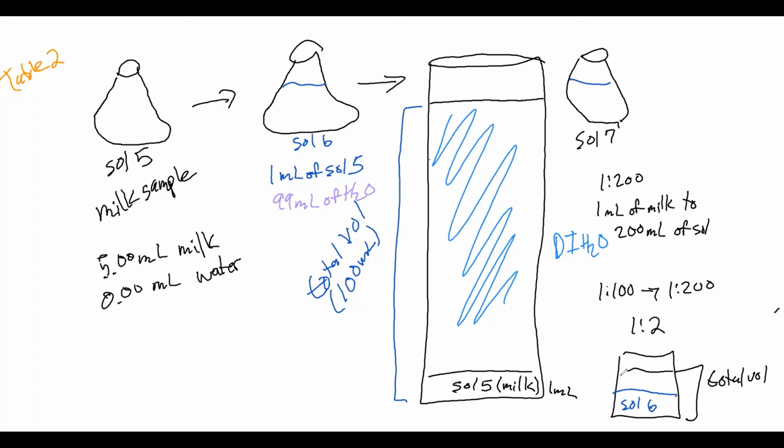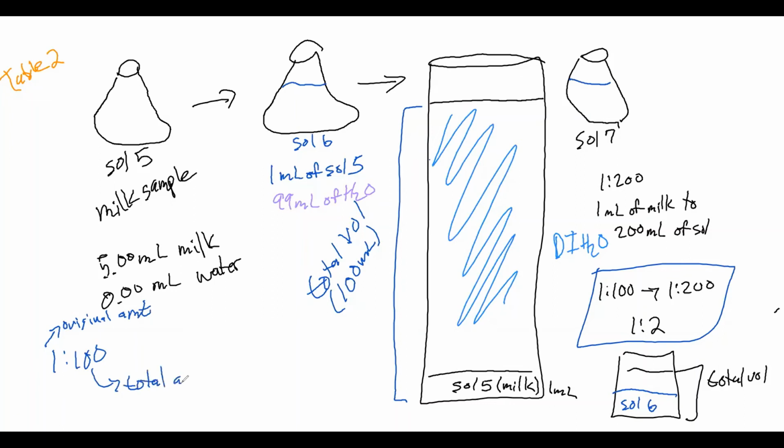So dilution factor is what's a little bit different for this one. And so you just want to think about what the numbers are saying. And so it's always comparing your original amount to your total amount. And so you can use that to fill in those next 2 parts.